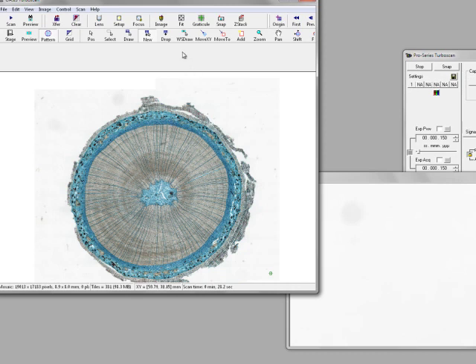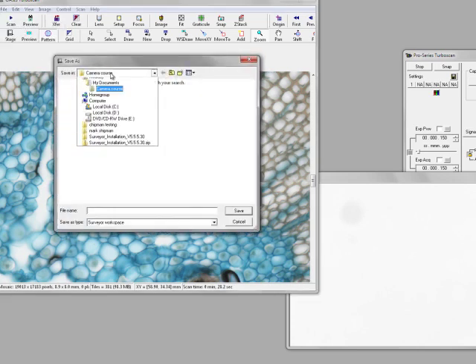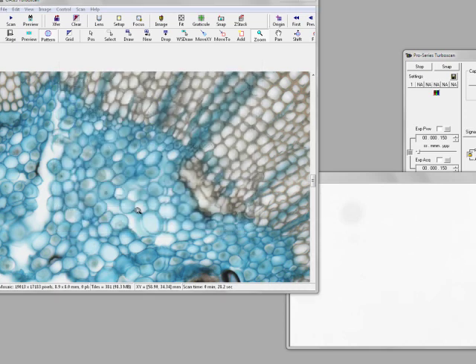We've got a really large resolution image. So I can zoom into this and keep looking, and everything's great. But what I can do from here is also I can save this as a workspace. Okay, and I'm going to save this workspace just somewhere maybe on my desktop. I'll just call it James.